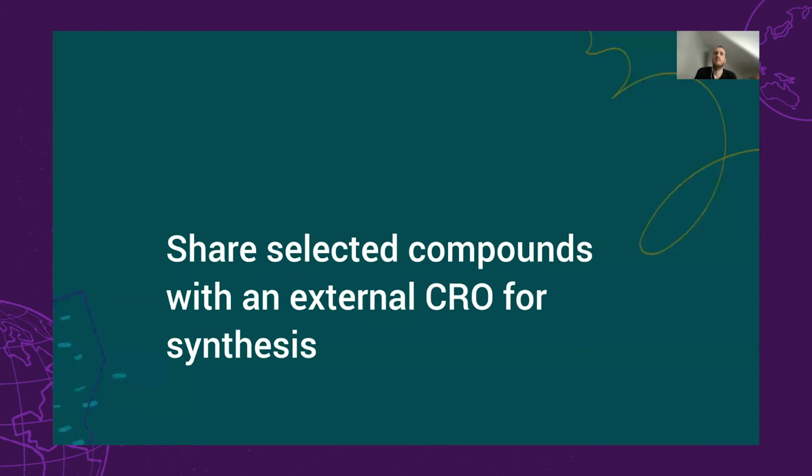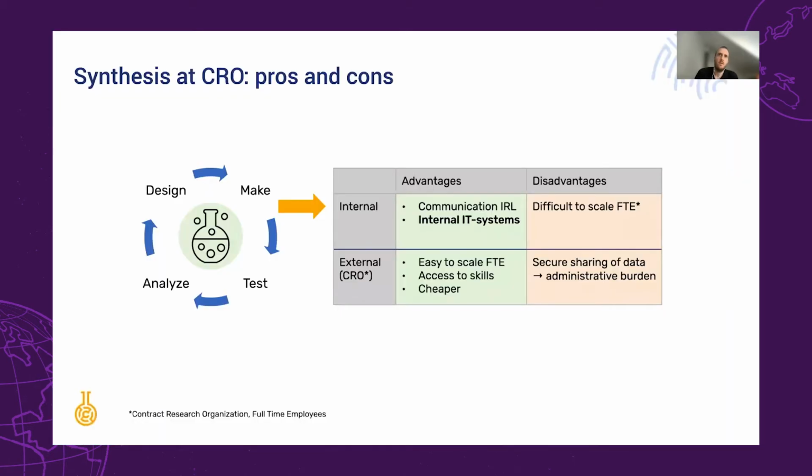Resources bring me to the last puzzle piece. In all MedChem projects, there is a question related to which compounds to make internally and externally. This is because both of these have advantages and disadvantages. So let's take a look at these a little bit.